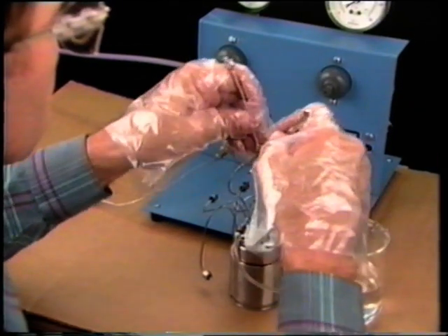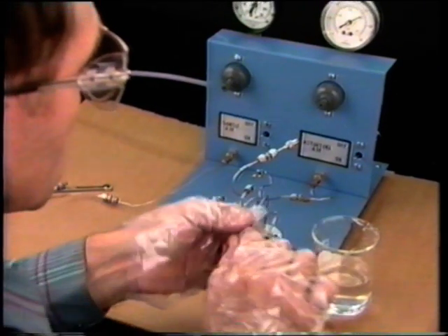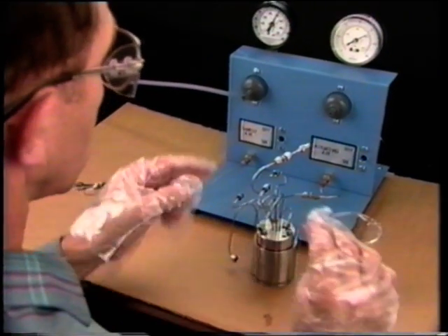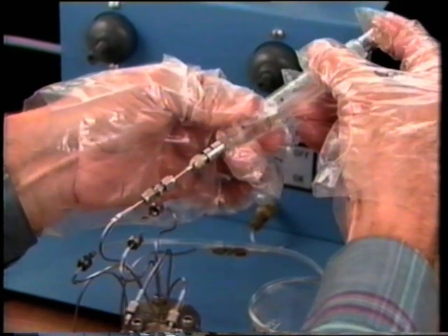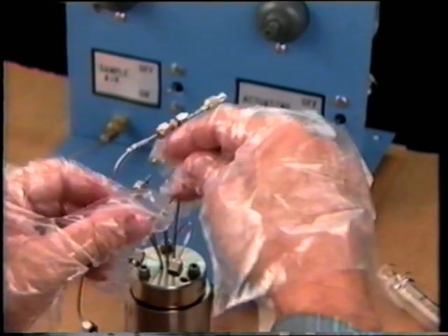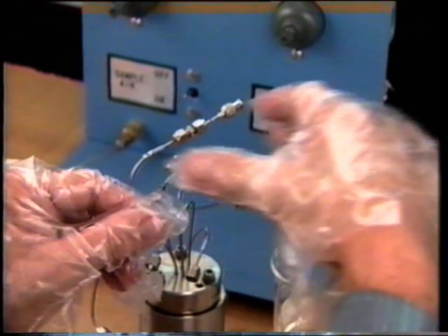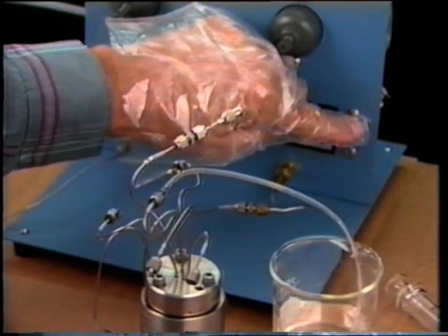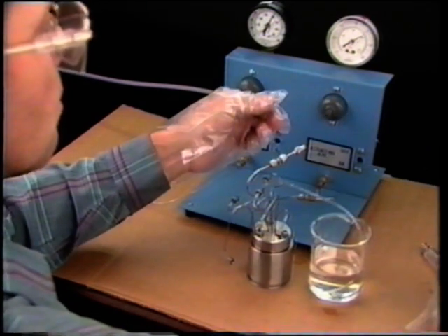Continue the procedure by attaching the syringe to port 3 and placing one end of the tubing on port 4 and the other end in the cleaning fluid. Use the syringe to force cleaning fluid through the passage between ports 3 and 4. Now, place the tubing from port 2 into the beaker. Switch the valve using air pressure. Force fluid between ports 3 and 2.